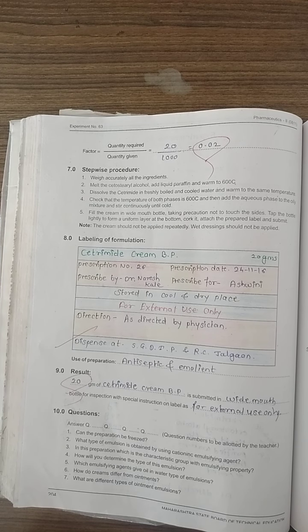In the aqueous phase, we have to add cetrimide and dissolve it in freshly boiled and cooled water. We have to warm it to the same temperature of 60 degrees Celsius. Then check that the temperature of both phases is 60 degrees Celsius.